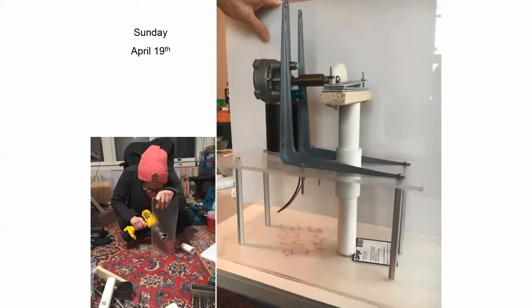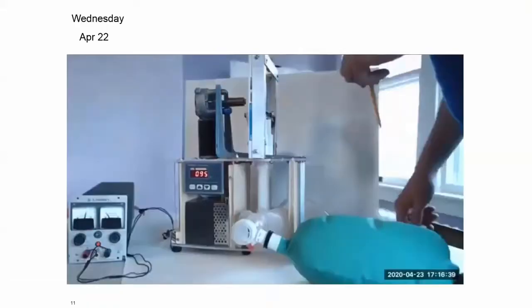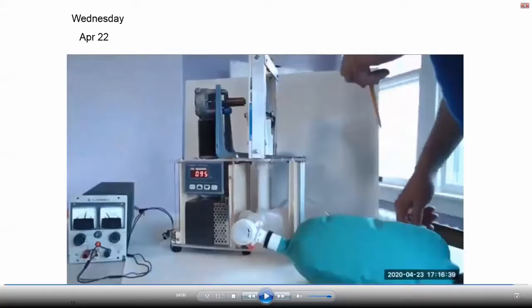This is what Patricia and I put together the prior Sunday. She helped cut a hole for the piston assembly. This is one of the trickier steps in the process. Over the next 2 days, I finished the rest of it. This digital version of the Mach 4 has digital controls and a backup battery switchover and alarm if the AC goes out.